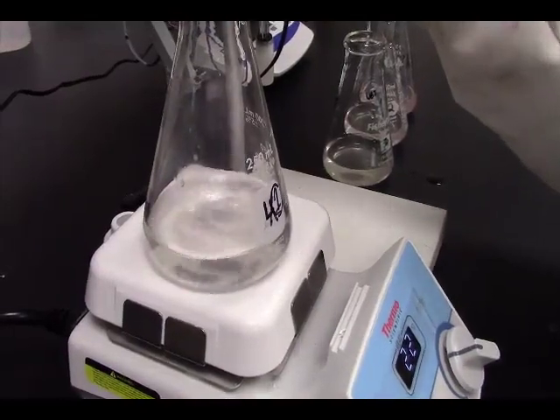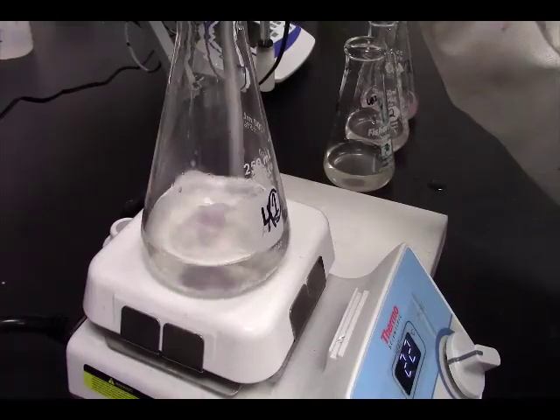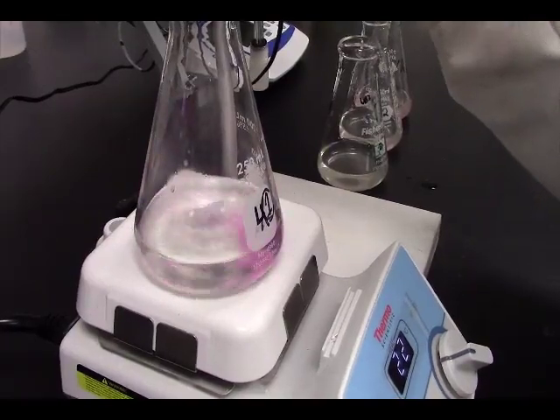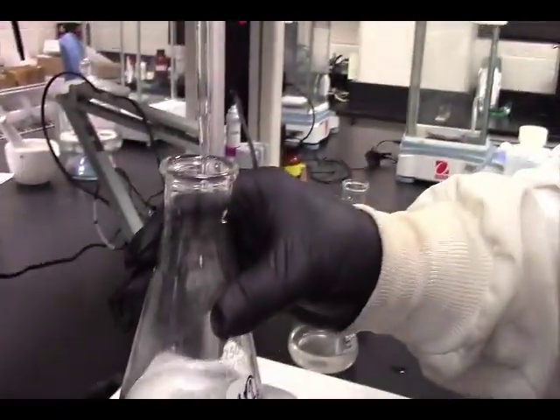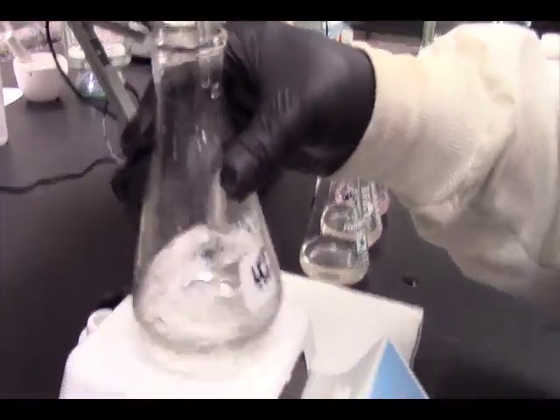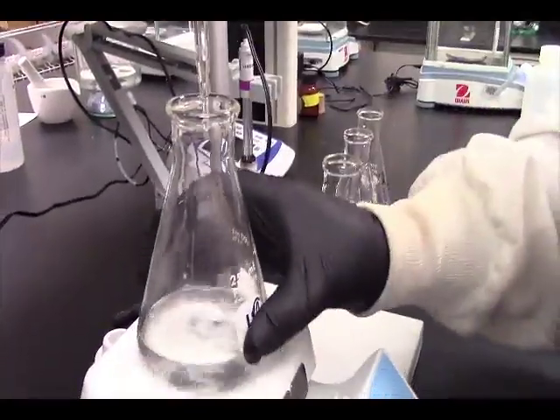As our pink starts staying longer, we're going to cut back our flow. Drip it in more slowly. Our pink stayed quite a bit, so that half drop that's on the end of our burette, we're just going to touch in here. That didn't do it, so we're going to take another half drop.